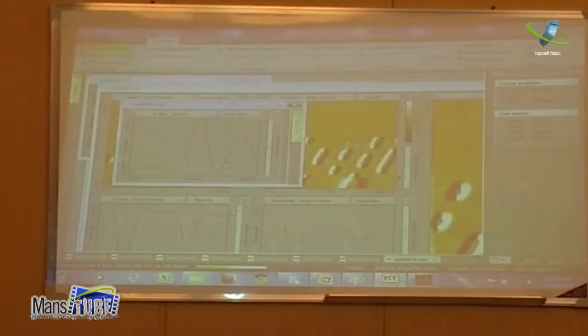It's amorphous, but how big is the molecule? Maybe something like DNA, for example. DNA is 100 nano. No, I mean what we are doing, we are scratching, I would say, a few molecules. Not 100 molecules. It should be like 10 or something like that. Let's say one molecule is 10 nanometers, for example. If you are scratching here like 200, maybe you are moving, let's say, 20, 30, 40 molecules.